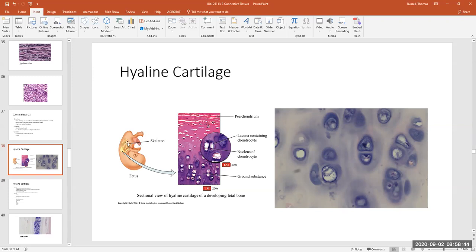In the hyaline cartilage slide you see strange little circles everywhere — in between the circles is a smooth area taking on a purple or pinkish coloration depending on the stain, or a grayish-bluish color. That smooth coloration is the ground substance of cartilage, which is called chondroitin sulfate. These little circles in the matrix are called lacunae — little holes in the extracellular matrix where the chondrocyte lives.